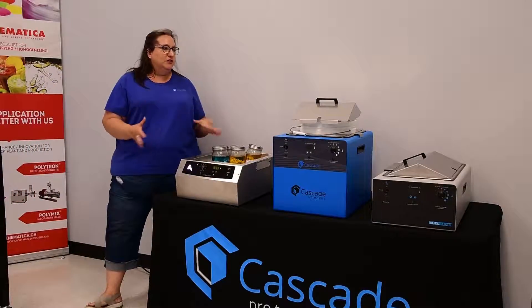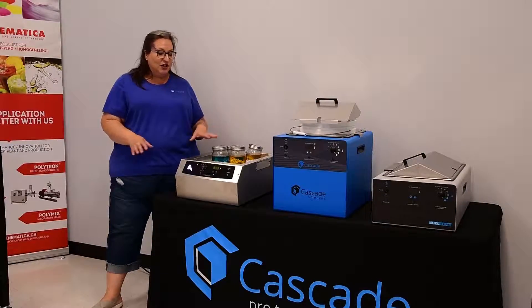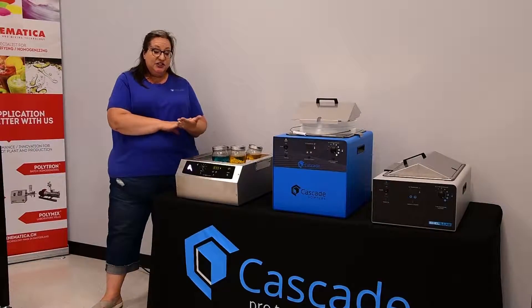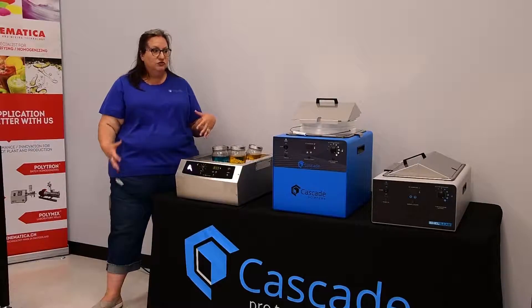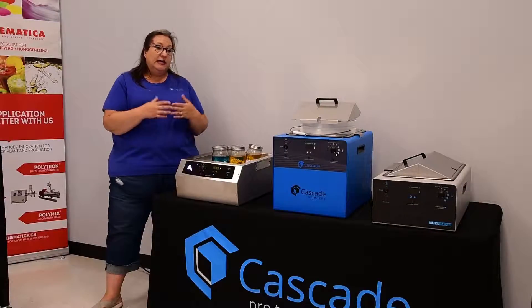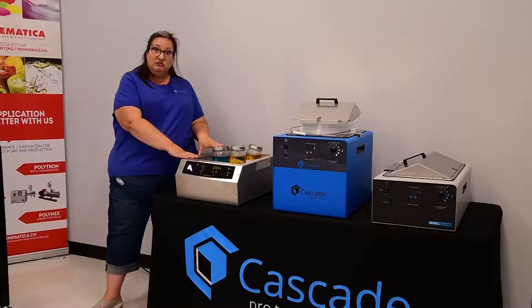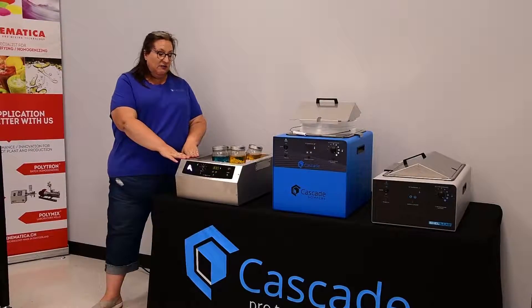Water baths are the most common piece of laboratory equipment in any lab. Oftentimes people think that microscopes are the most common — not so. Water baths are extremely useful. Anything that needs to remain at body temperature, which is 37 degrees C — biological samples like throat cultures, wound swabs, blood cultures — things that need to remain at temperature are going to stay in here until they're plated and put into an incubator. Frozen biological samples like blood or plasma will be thawed out gently in a water bath before being introduced intravenously to a patient.